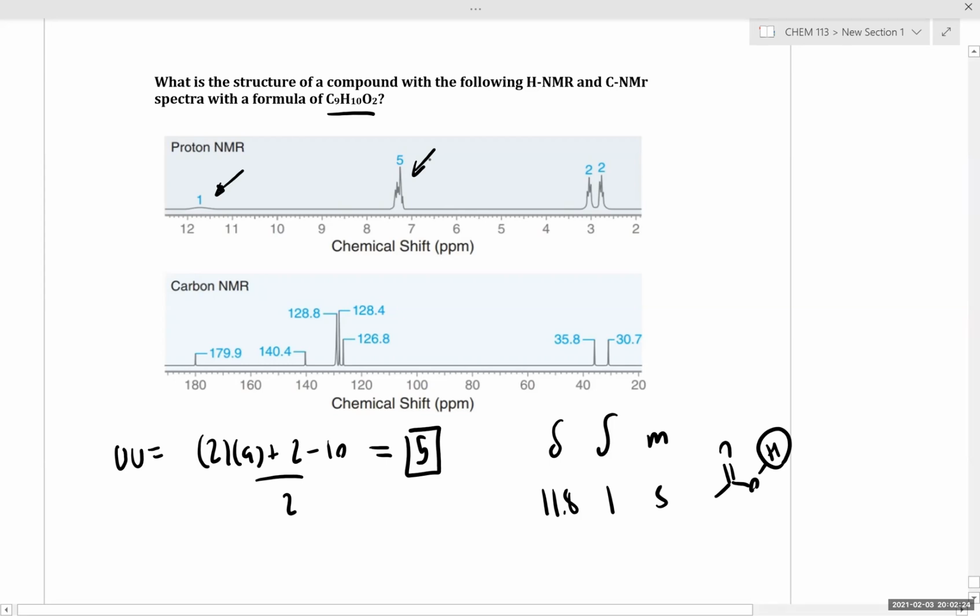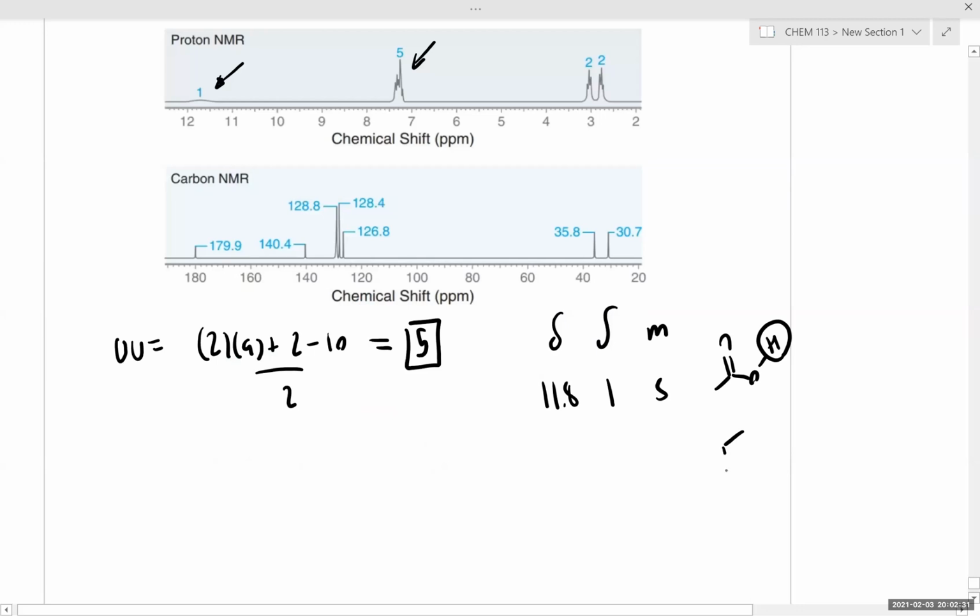The aryl protons. Okay, yeah. The benzylic protons have a different shift, but the protons directly attached to the aromatic ring do show up around 7.5 to 8 part per million. And this 5 hydrogen integration tells us we have 5 of those aromatic protons. So it's not quite cyclohexane, but more of a benzene ring, or generally aromatic protons that have chemical shift values around 7.